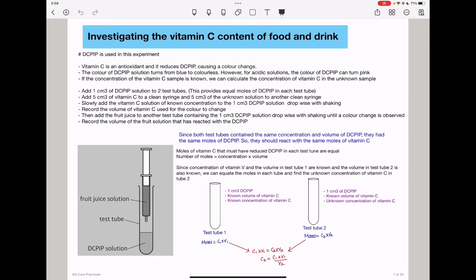However, if solutions are acidic, there is a chance that it's going to turn pink. So you need to know those colors. In this experiment, we'll refer to a vitamin C sample whose concentration is known, and then we'll use that to calculate the concentration of vitamin C in an unknown sample.